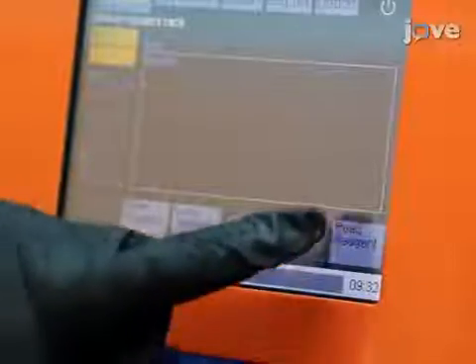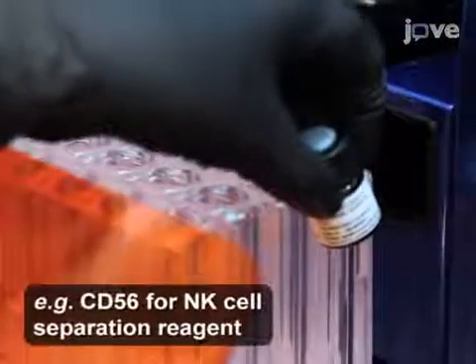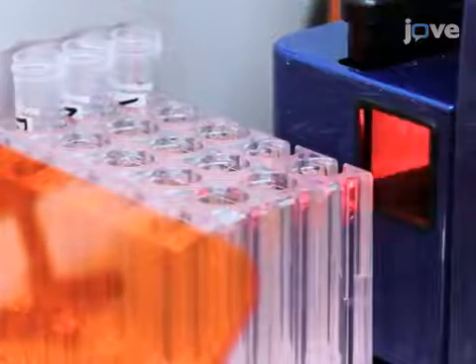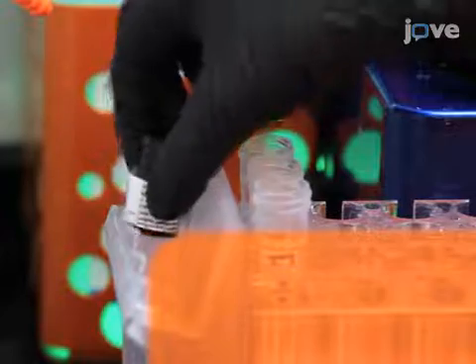Select Read Reagent to activate the 2D code reader, and hold the appropriate reagent vial in front of the 2D code reader at an angle 0.5 to 2.5 centimeters from the code reader cover. Place the read vial into the appropriate separator rack position.